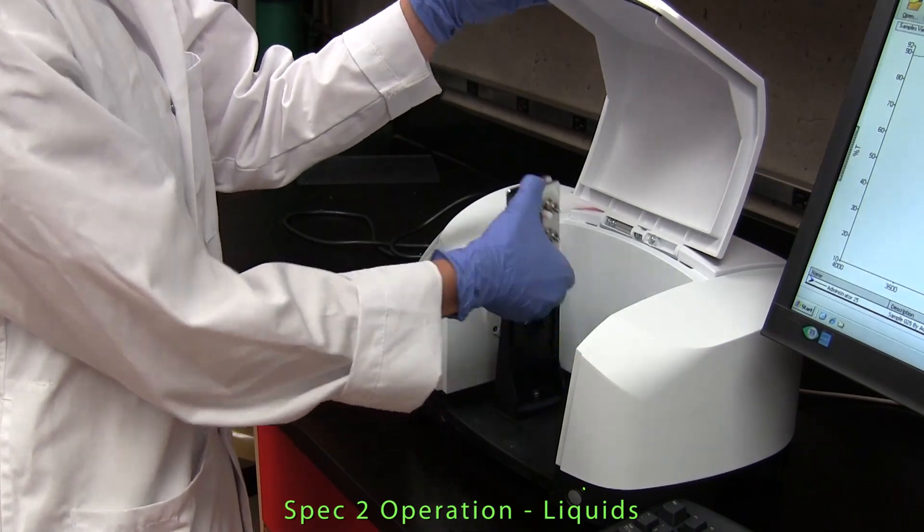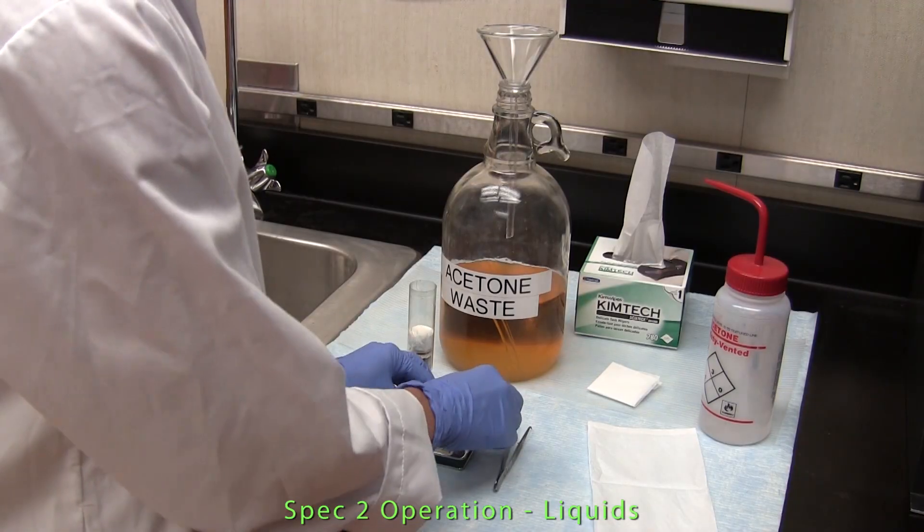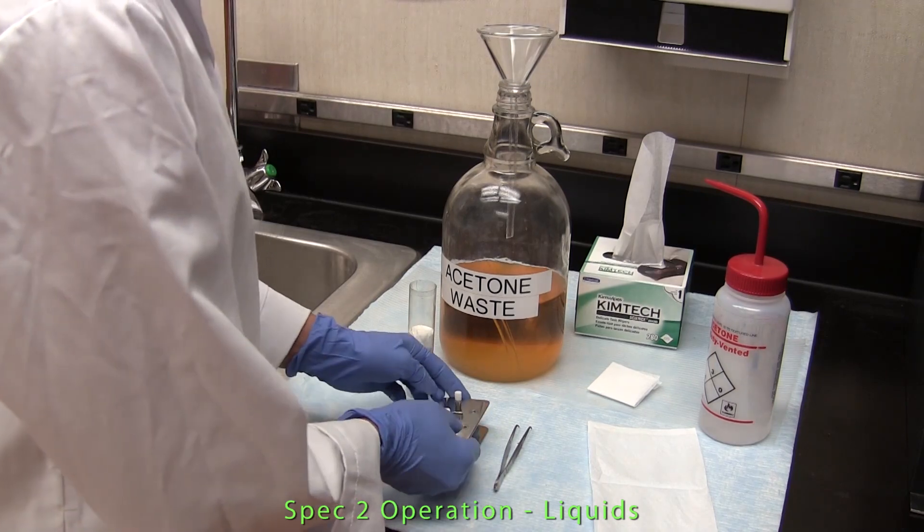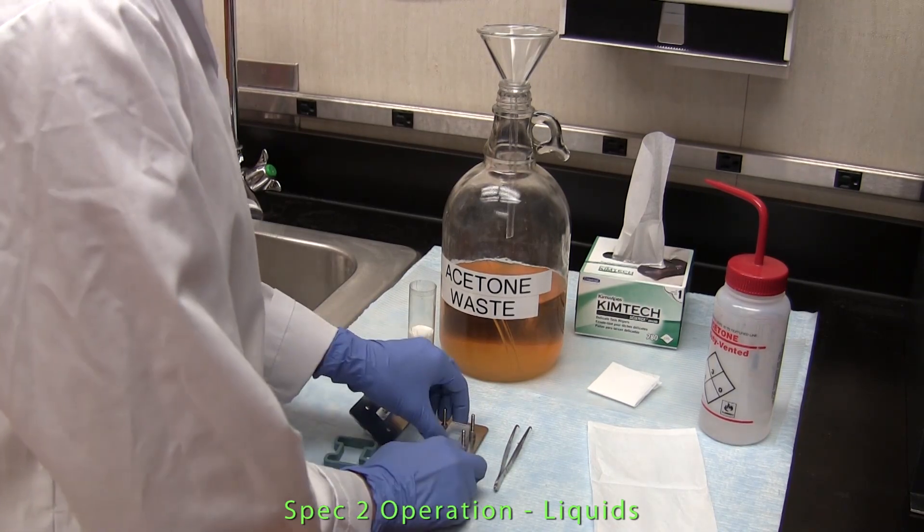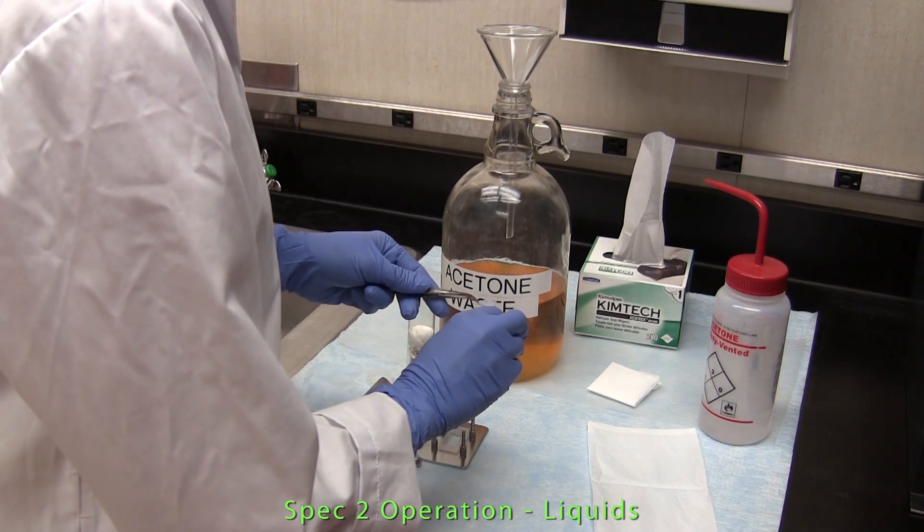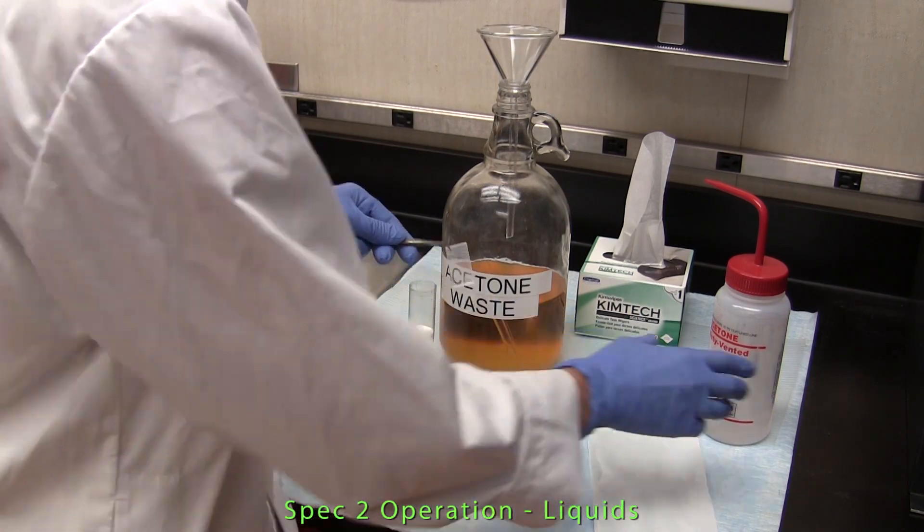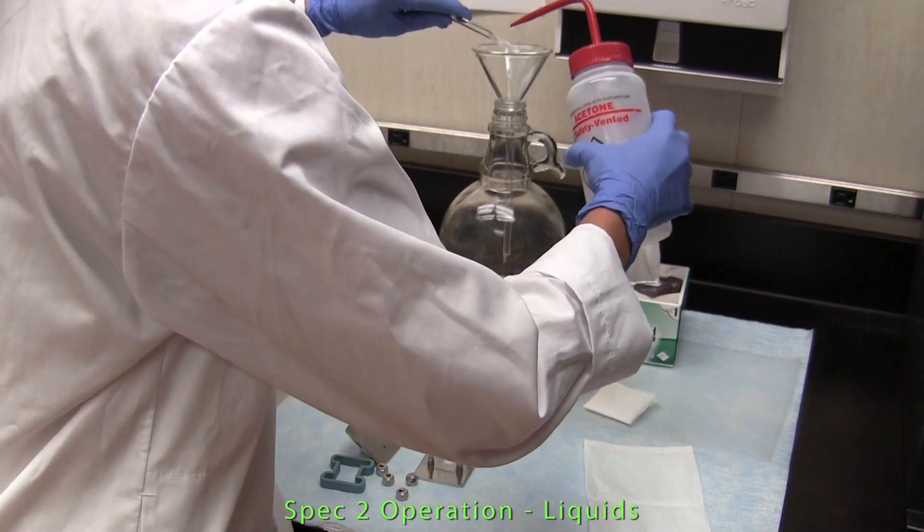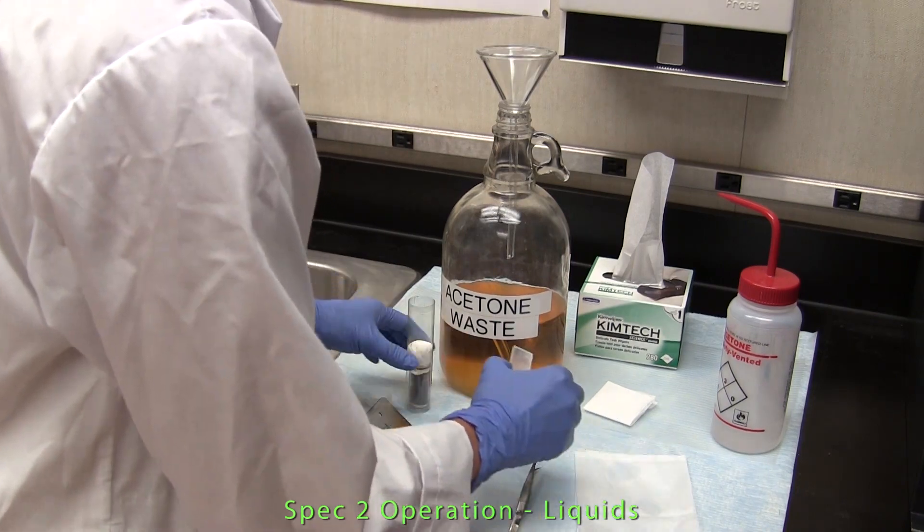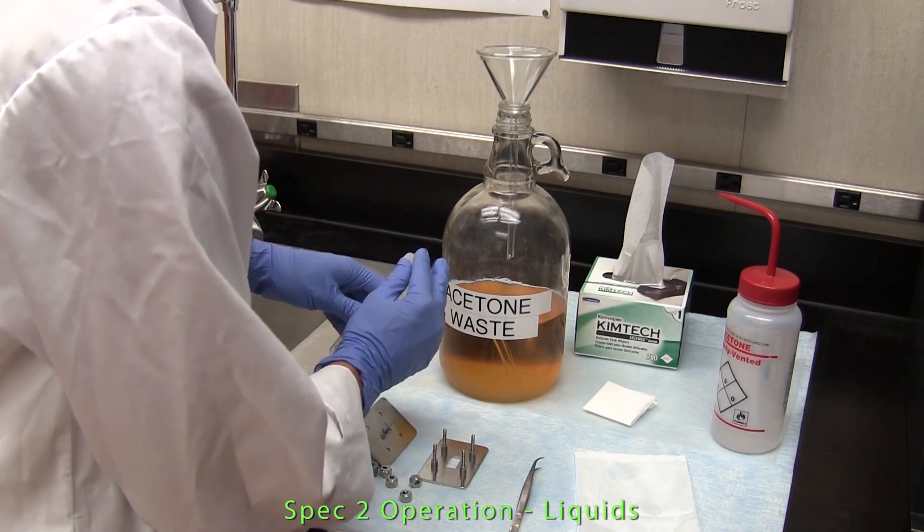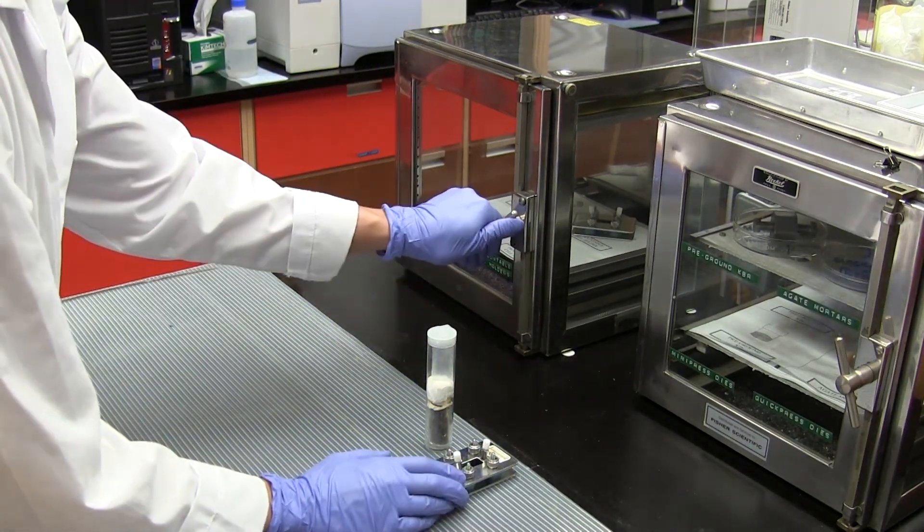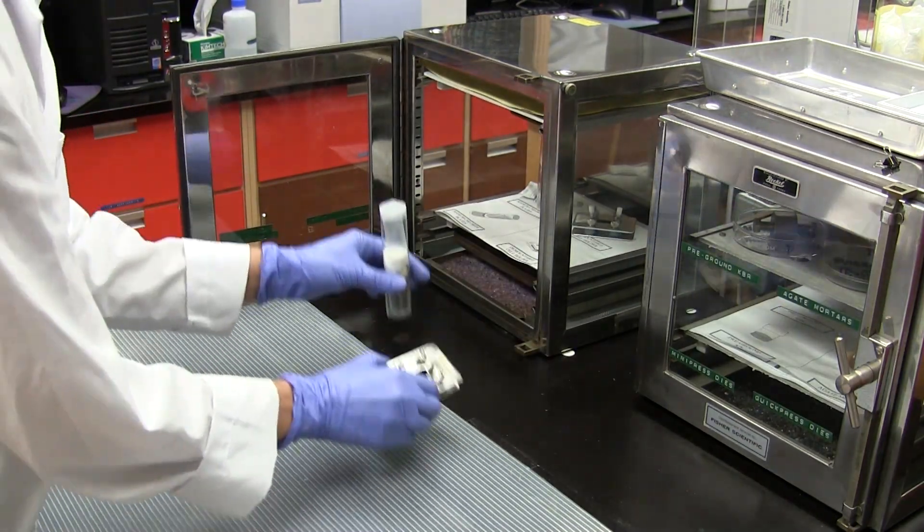The demountable cell is removed from the sample compartment and disassembled. The sodium chloride plates are cleaned with acetone. Once cleaned, they are wiped dry and returned to the storage container. The pieces of the demountable cell are reassembled and together with the sodium chloride plates, returned to the desiccator.